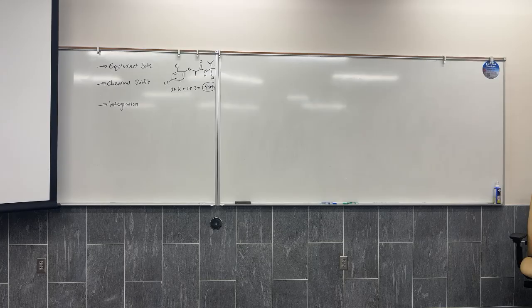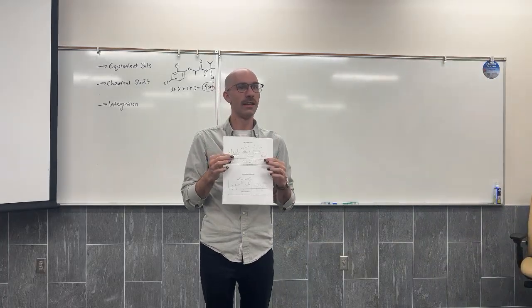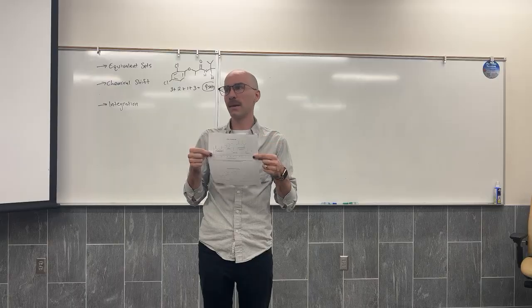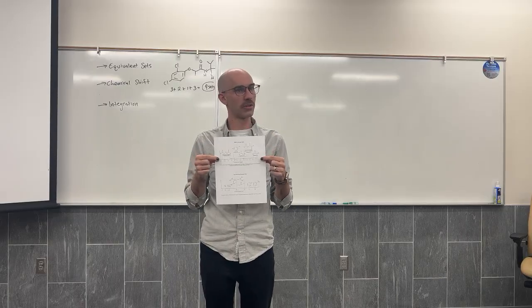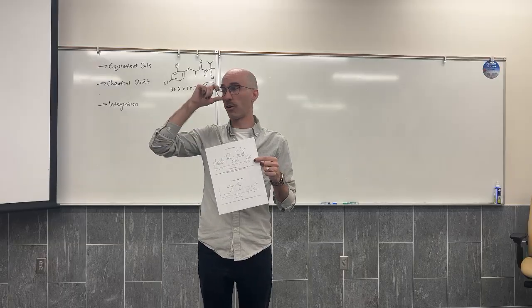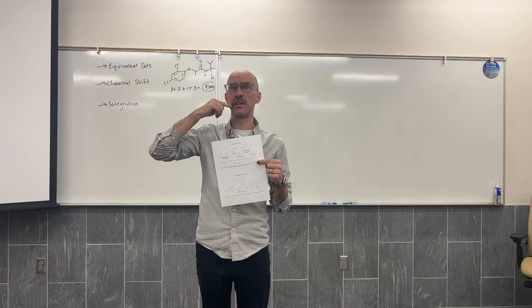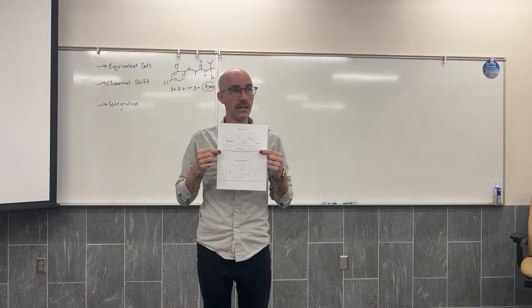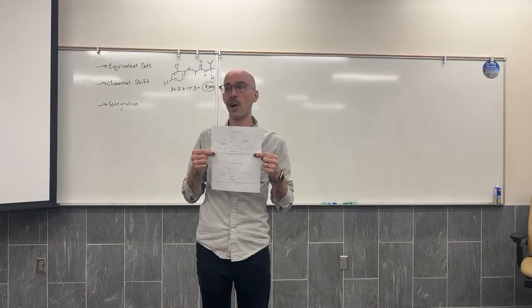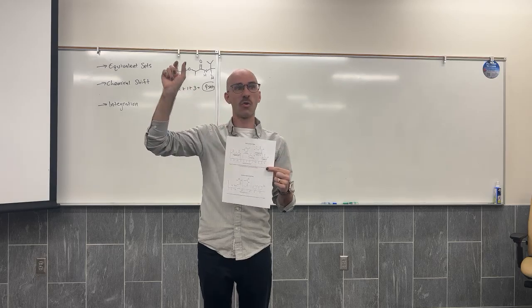Bonded to more electronegative groups, more to the left. But then you look at the correlation table for proton NMR. By the way, there are many, many types of proton NMR correlation tables because nobody agrees on one way to do it. Our course lead, Ron Valcarci, has a document. You guys will find that document if you're doing the PLO on spectroscopy, the one that's at the bottom of this module.